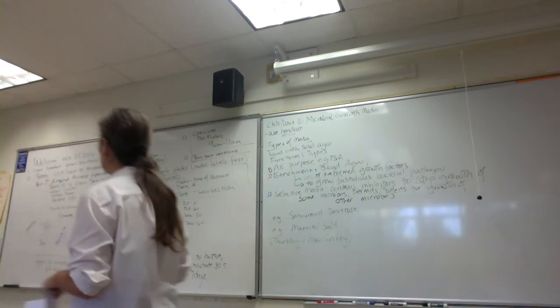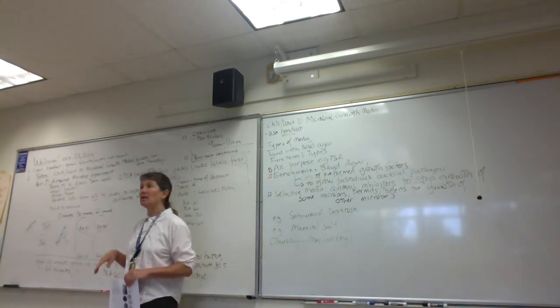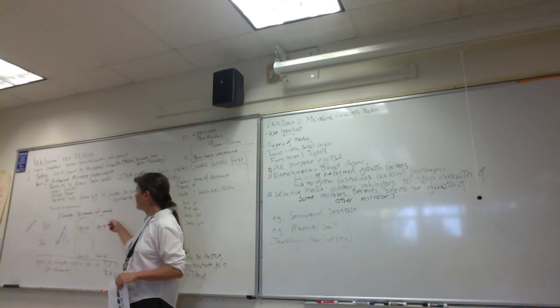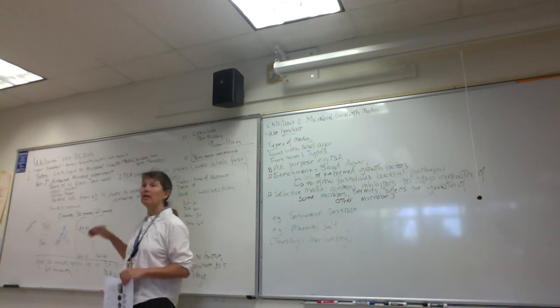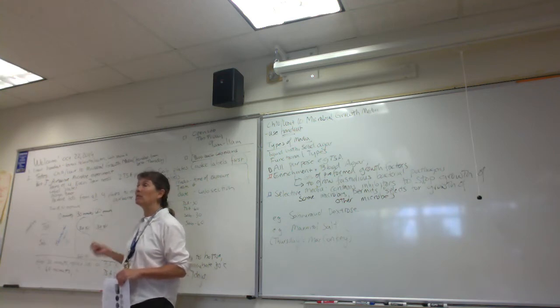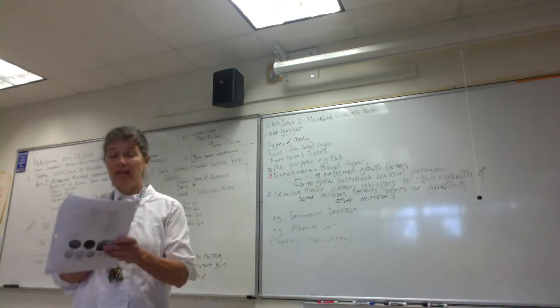Okay, so you guys, what would be your guess? Looking at total number of colonies, which medium do you think should grow the greatest number of colonies? Our all-purpose TSA or the selective SAB? The all-purpose, right? Because we should be growing both bacteria and fungi, right? On the SAB, we're going to think most of them are going to be fungi, either yeasts or molds. Good job, folks.